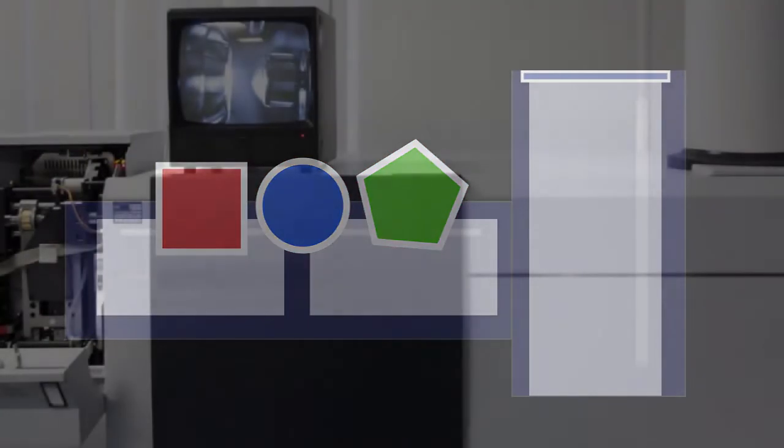How it all works. Firstly, we take a blood or tissue sample, and the mass spectrometer then works in two stages. In the first stage, the sample is passed through the instrument where the masses of its individual components are measured by their time of flight.